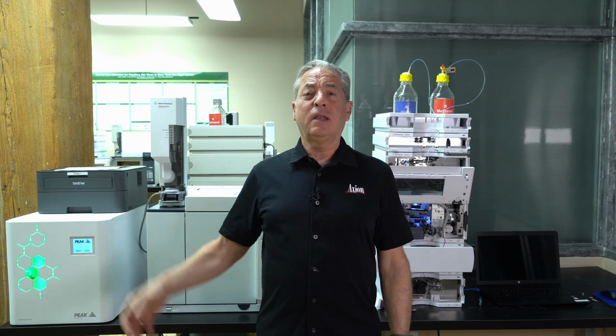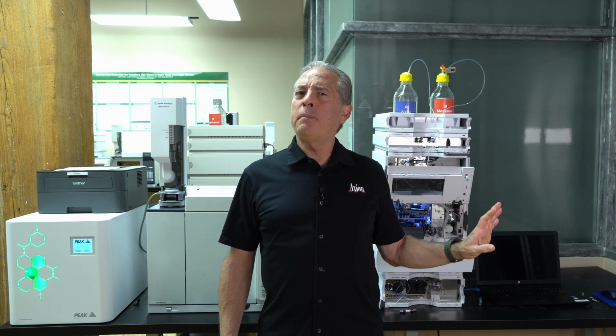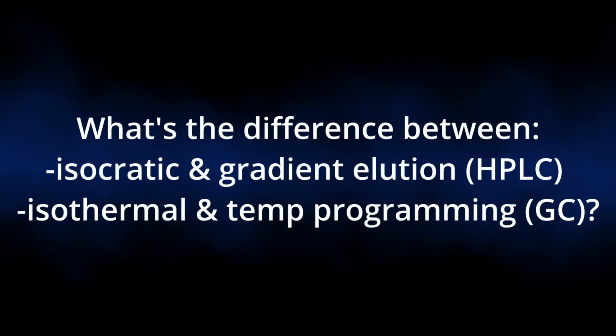GC, it's simple, it's all in the inlet. LC, it's probably in the pump, but we're not going to take apart the pump unless we have to.